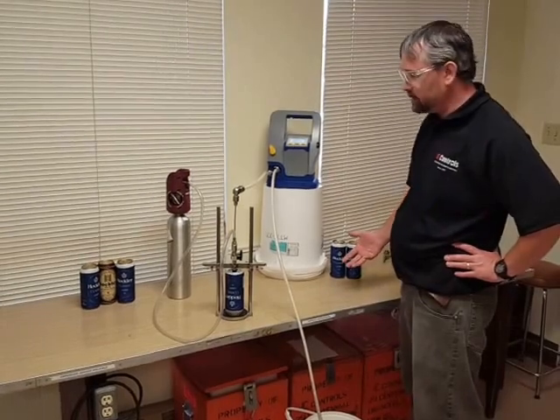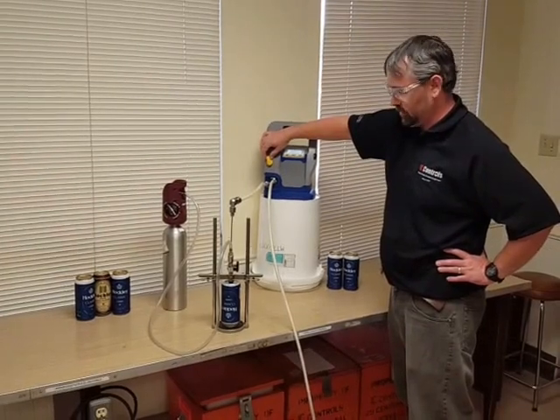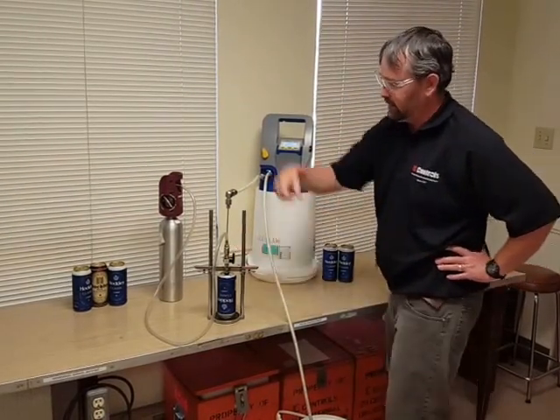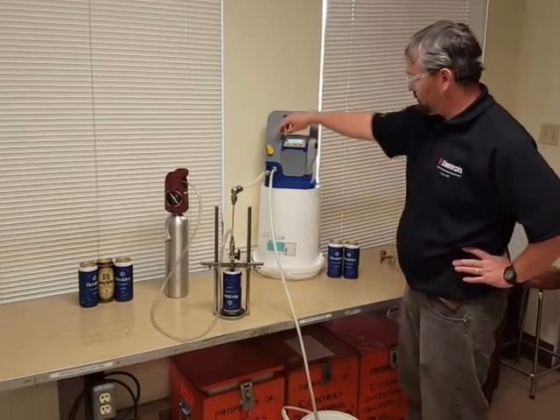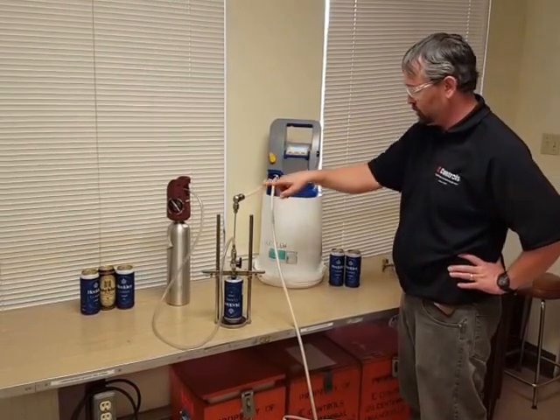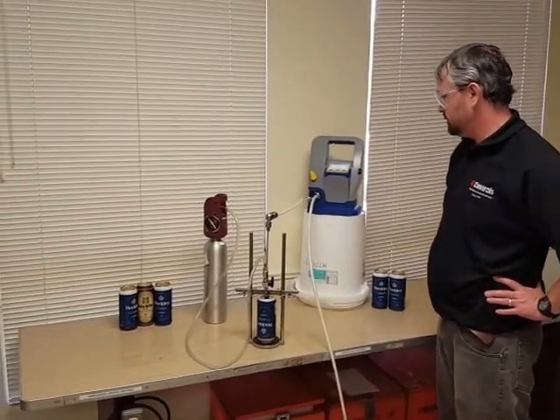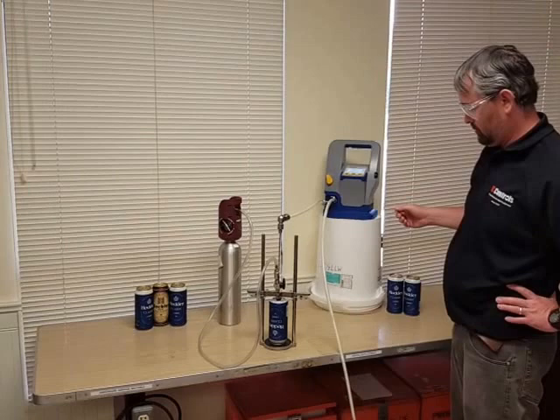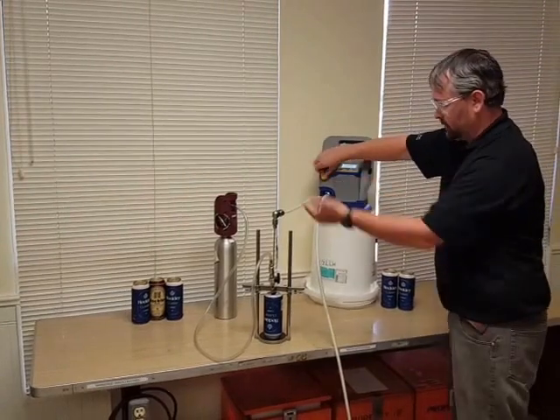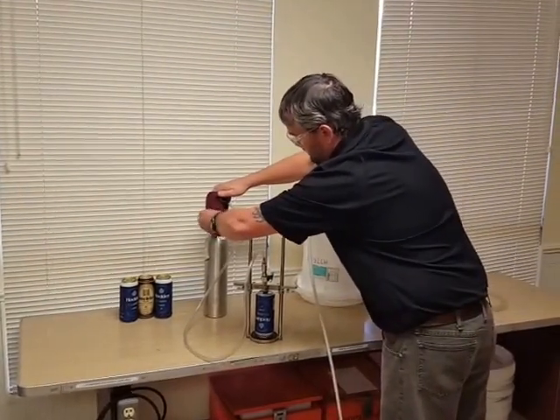When you're done, you go through the shutdown backwards. Once you see air, turn off the flow valve for the meter, then turn off your nitrogen valve, and then turn off your nitrogen tank. Once the beer has flowed through, I'm getting a zero reading which basically shows it's pushing nitrogen. So turn this off and close that.